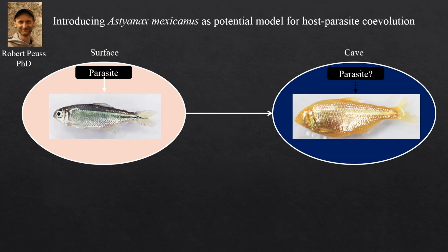Quickly, I'm going to describe 2 short stories today in terms of the science that we've done. One of them is in this interesting organism, Astyanax mexicanus, the Mexican tetra fish. One of our investigators here at the Stowers Institute, Nick Rohner, his group is working with this fish and using it as a model for evolutionary biology, because what's interesting is that these fish live in rivers down in north central Mexico.